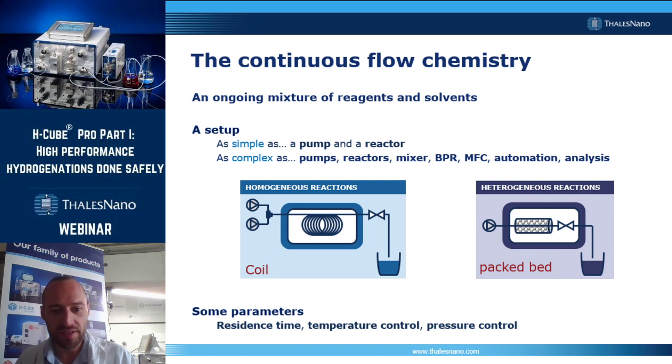Eventually, there are three important parameters to remember. A residence time, which is the reaction time basically, a temperature, and a pressure control. Those are the physical parameters you have to play with and fine-tune in order to improve and to get a better selectivity and a better yield.